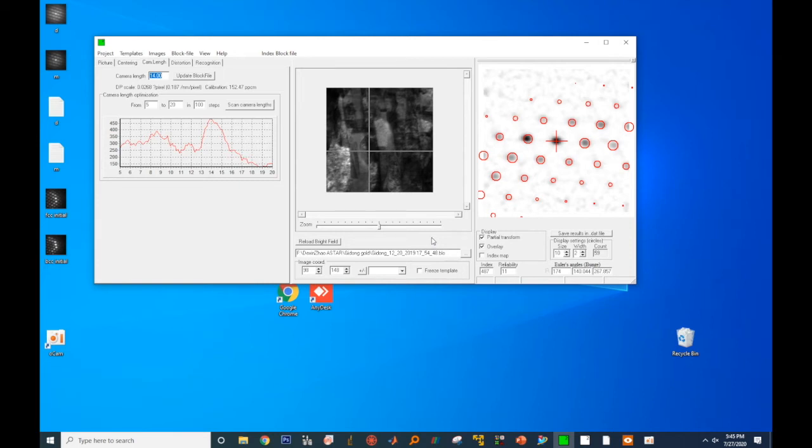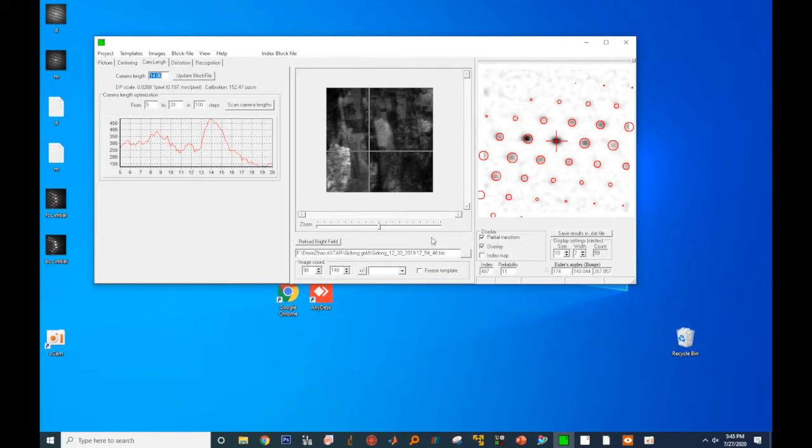In the previous video, we looked at the data analysis and data reconstruction. In this video, we'll show you how to visualize the PED results. Again, this session was assisted by my student Dershing Zhao, and the sample was kindly provided by Professor Zhidong Xin from KAIST.